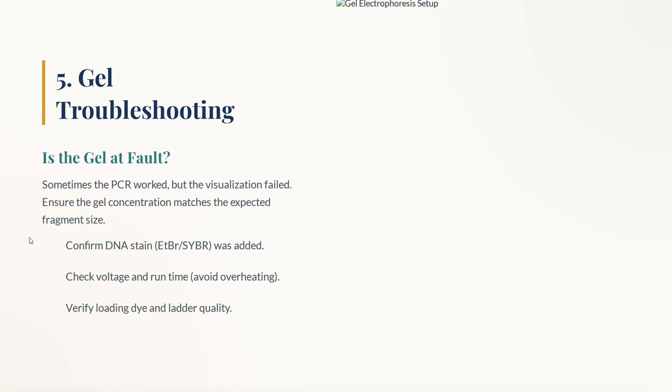So you just run them with the loading dye, any dye you can use, whichever you use for the PCR product, the same one. Maybe 2 microliters of your dye and 2 microliters of this primer, and you load into a 2% or higher percentage gel. And if you see a band properly, that means your primers that you have diluted are alive, they are fine.